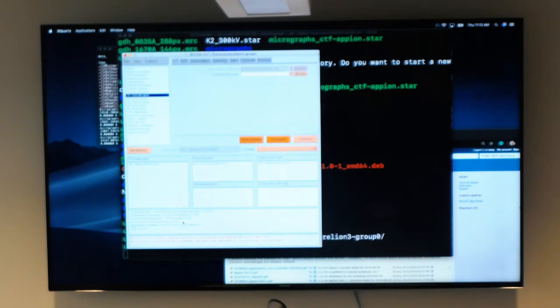Okay, so what we want to do is, based upon this star file, it wants to have, let's say, this micrograph here. And that looks fine, right? It finds it. You also have it in multiple places. I guess you copied it there and there.